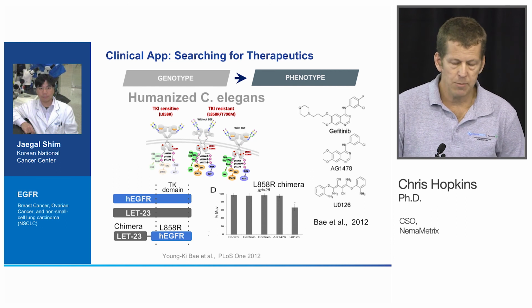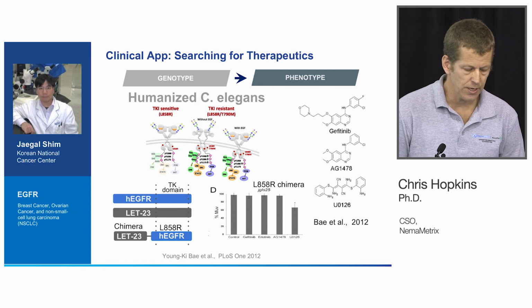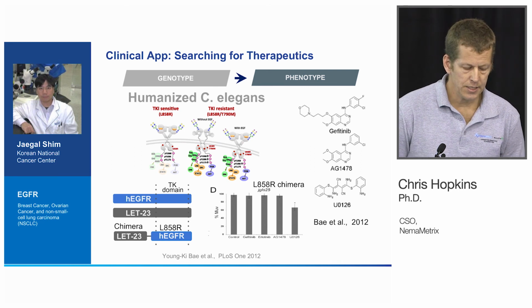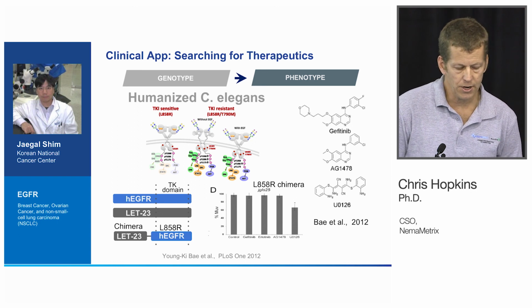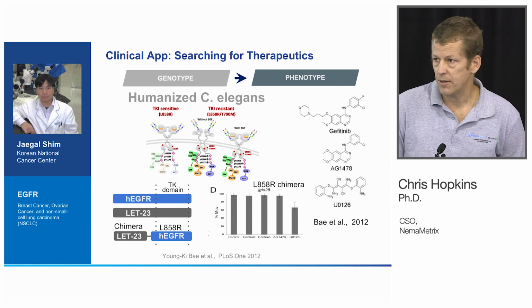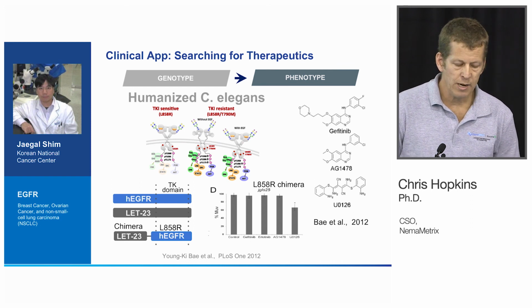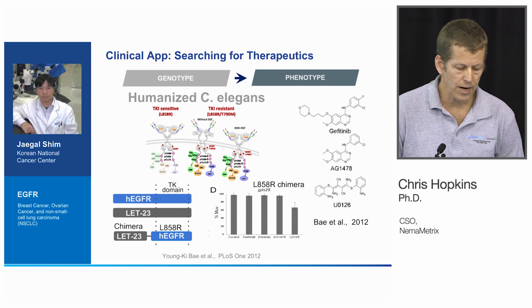And then on top of that, he built in various pathogenic mutations, and one of them being the leucine to arginine mutation. When he looked at this leucine to arginine chimera and tested it for a phenotype that is a strong indicator of a carcinogenic output, which is this MUV assay, he saw a significant amount of MUV formation. But when he exposed it to various chemicals, he found that one chemical was leading to a reduction in the amount of that cancerous readout.